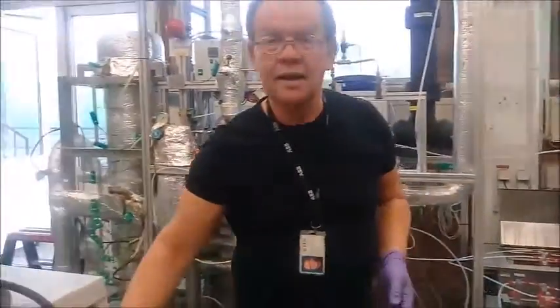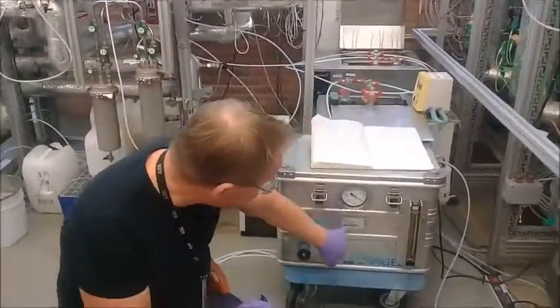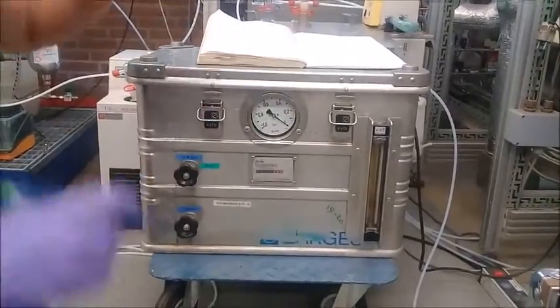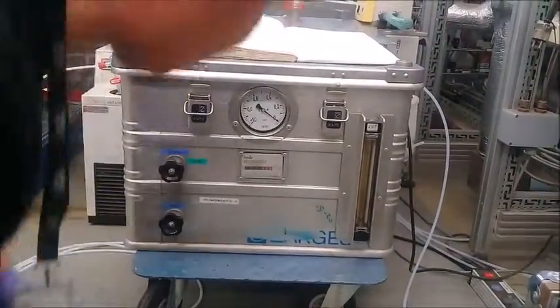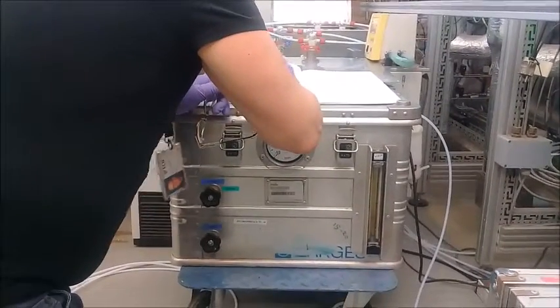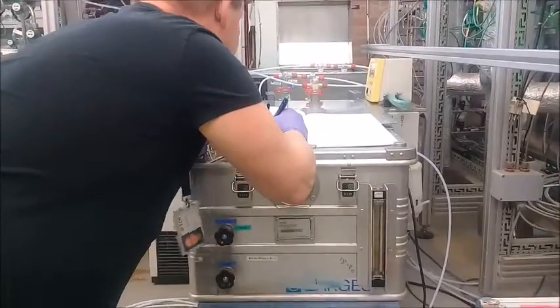And so what I'm going to do is I take the readout of the pump in order to know how much gas will pass through the washing bottles. And I write down the reading, which is 47.263.